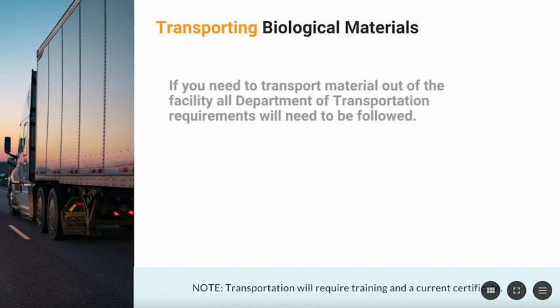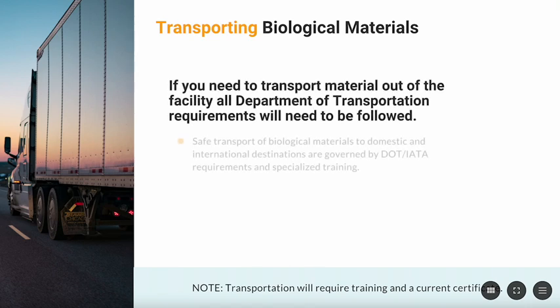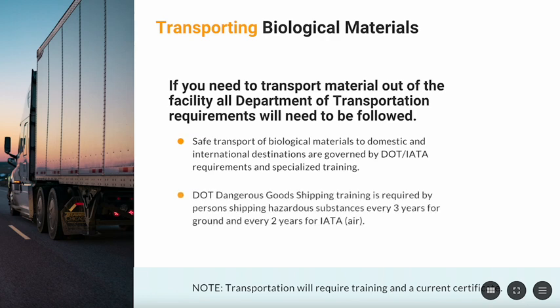When transporting biological materials out of a facility, it is important to follow the requirements set by the Department of Transportation, DOT, and International Air Transport Association, IATA. The safe transport of biological materials to domestic and international destinations is governed by these requirements, and specialized training is necessary to comply with them.